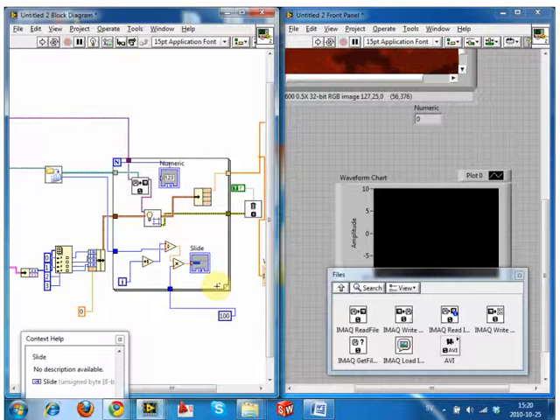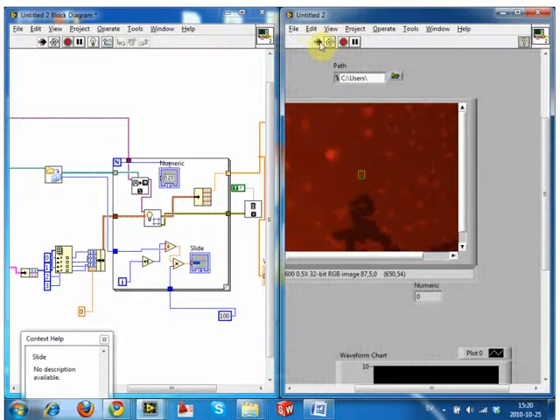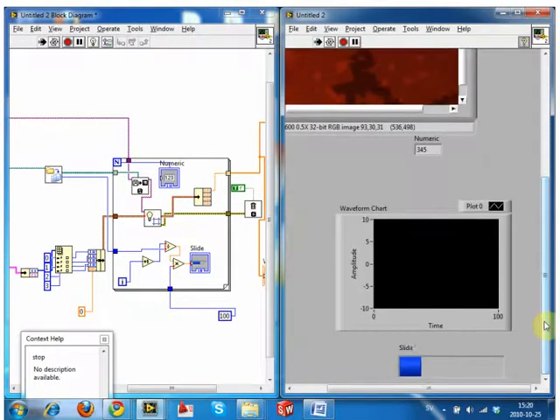It simplifies things rather than having to set upper and lower bounds and ranges and things. But I'd be intrigued to see if numeric actually has data in it. I don't know, I have never done it that way. Well, we can just run it and see what happens. Yeah, so it does work. So you can just run it from n.